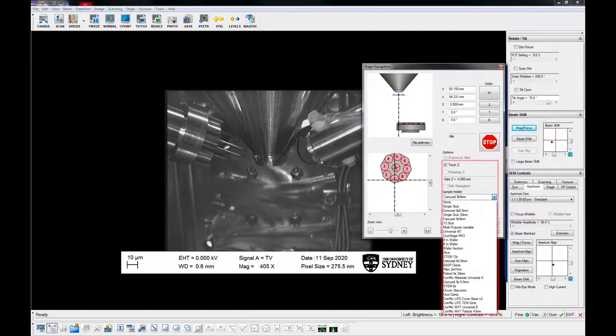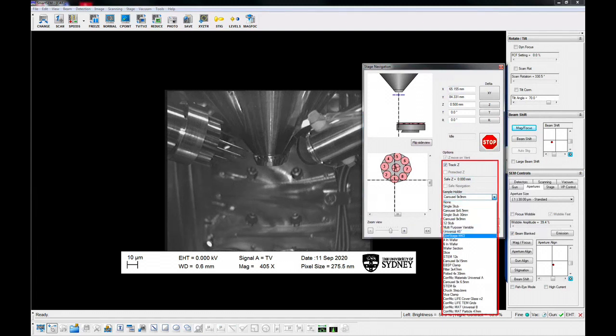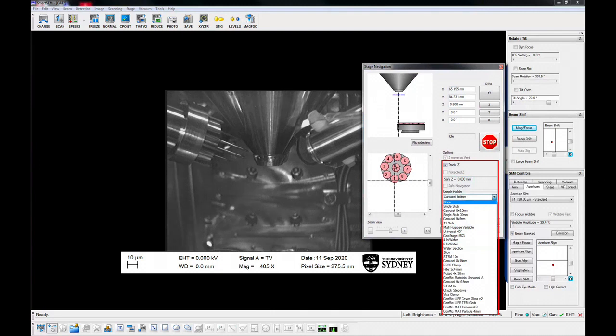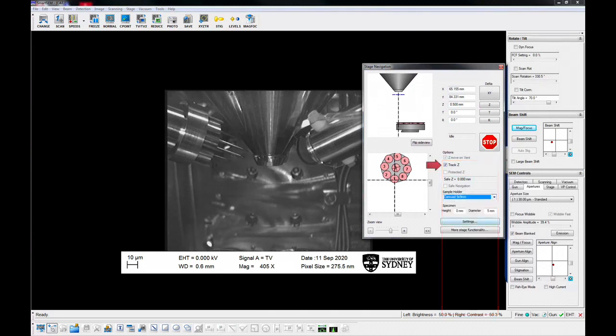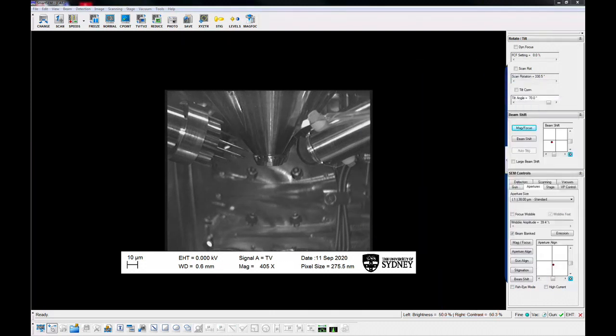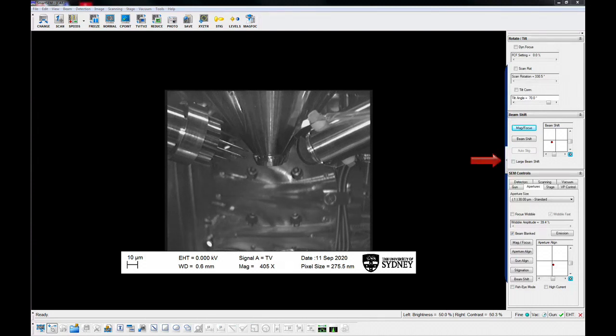Select carousel 9x9mm holder in the stage navigation panel and make sure the track Z is checked. All additional control windows and panels can be found in the pop-out list, triggered by the little arrow on the right side of the scanning image area.